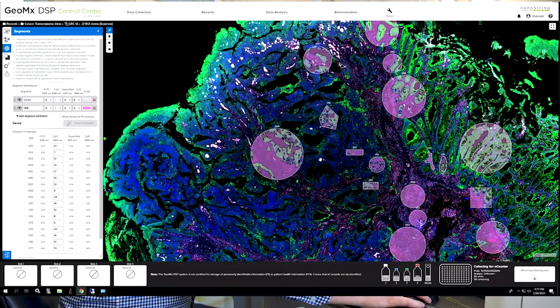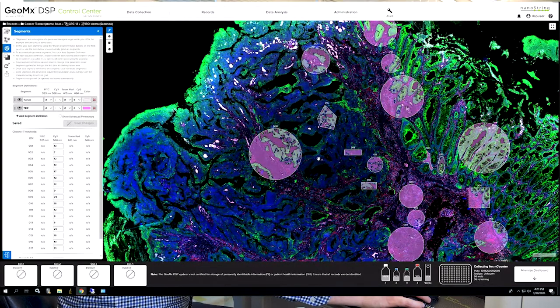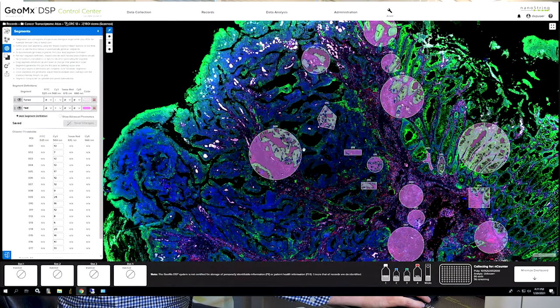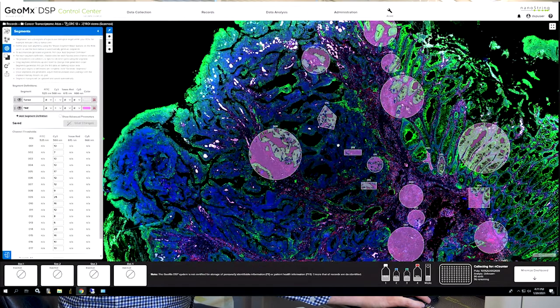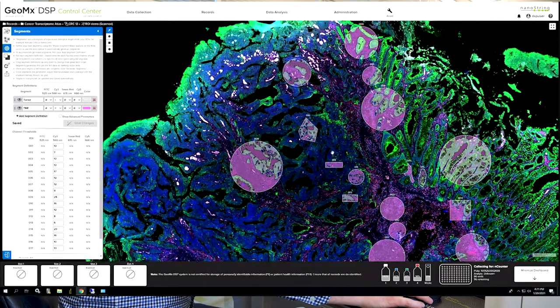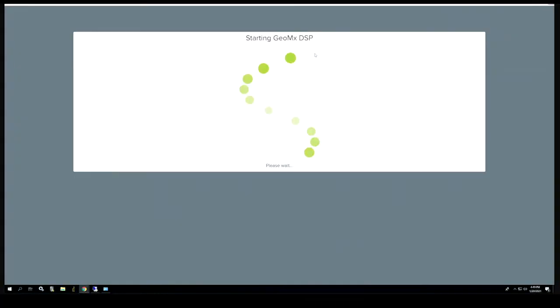Selected ROIs are illuminated with UV light to release barcodes from DSP probes. And then these DSP probes are deposited into a 96-well plate.